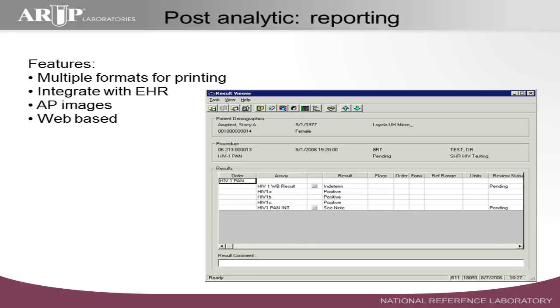And does anybody, I'm just curious, does anybody know what the problem with just reporting labs to a system where it's displayed only, like a web-based system? If we only pushed out results to a system that displays it, are there any flaws with that approach? Can anyone think of a... Maybe you can't get feedback from the client? No feedback from the client? That could be one.